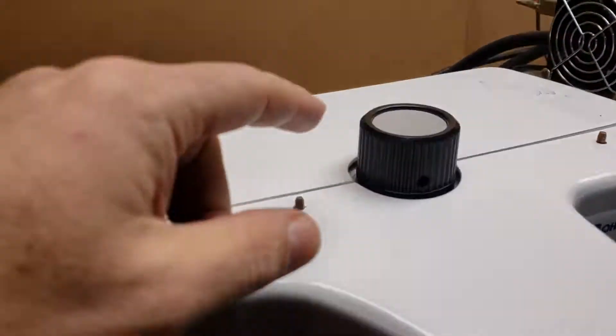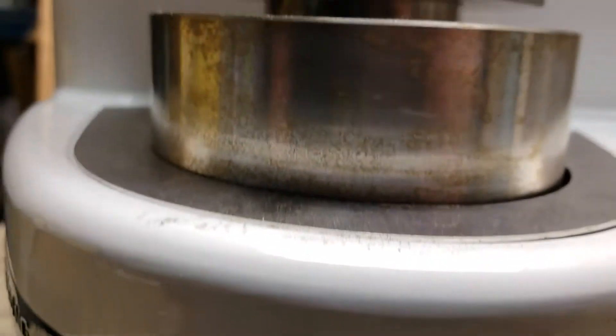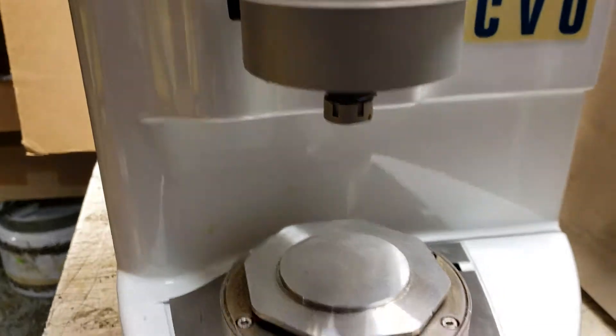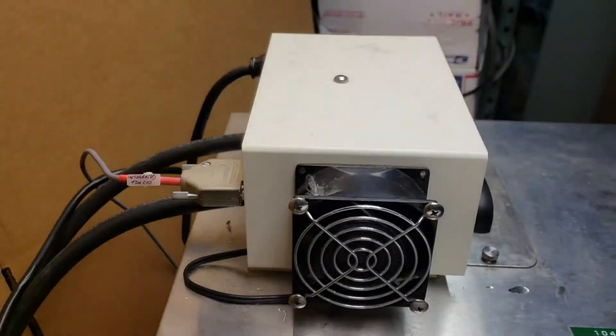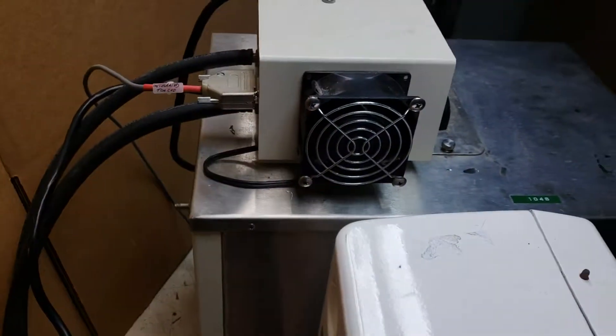The top's turning now, and I think that bottom piece is raising up. That's definitely turning. And that's the unit. Let me know if you have any questions or if I can do a test or whatever else. Thank you.